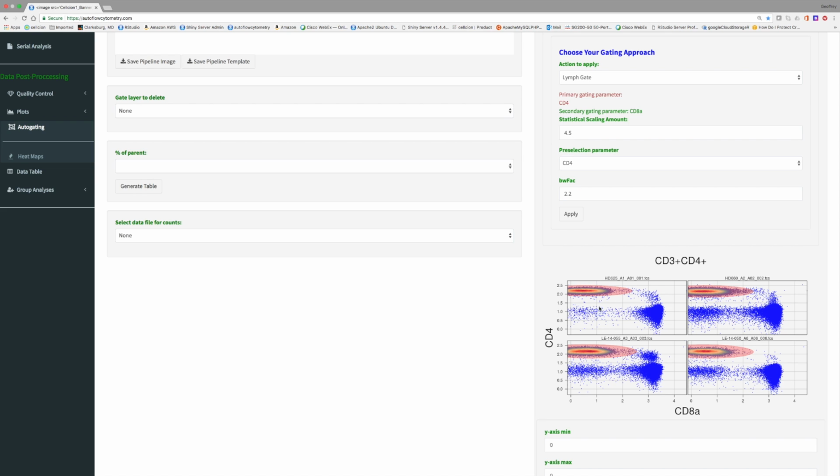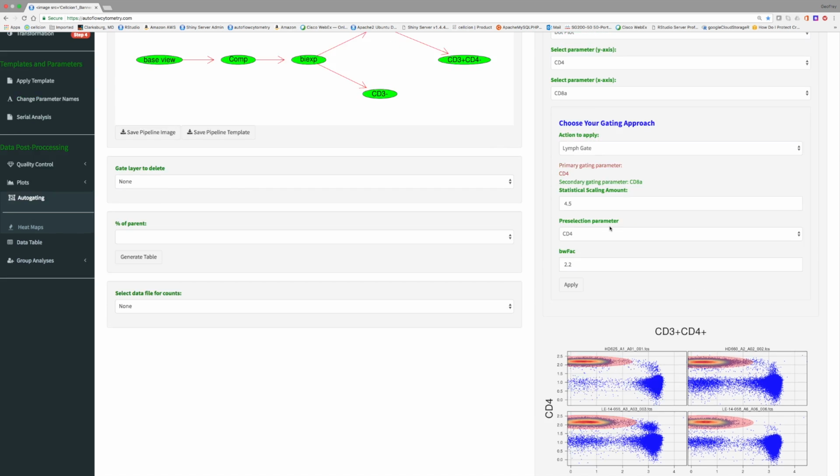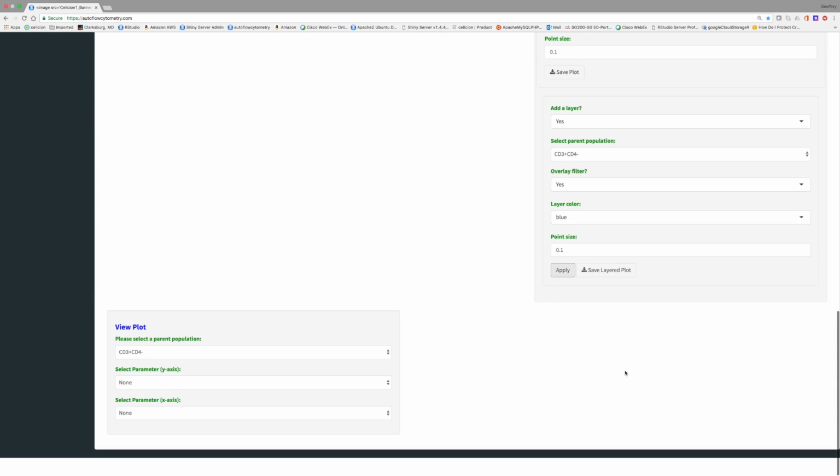Okay, so from this point, what we'll do is try a different type of gating analysis, something perhaps slightly more subtle. Again, the BW factor is something that we'll discuss in more detail coming up. Essentially, the default values tend to work fairly well if you're working with these types of populations, whether it be B cells, T cells, NK cells, or granulocytes, whatever. We tend to stick with the default numbers, but you can play with those, and that's something that you pick up empirically.